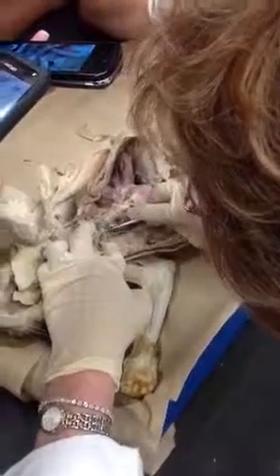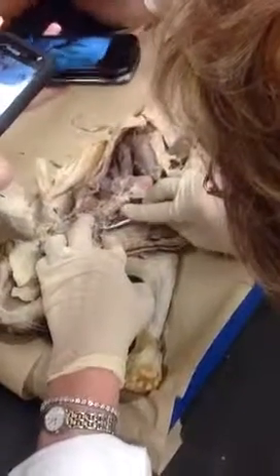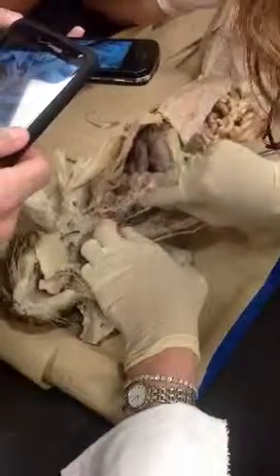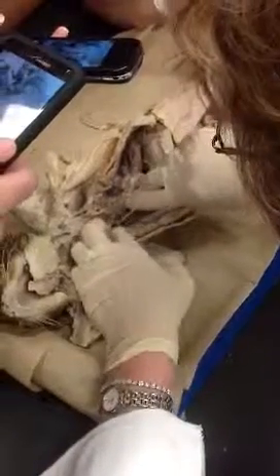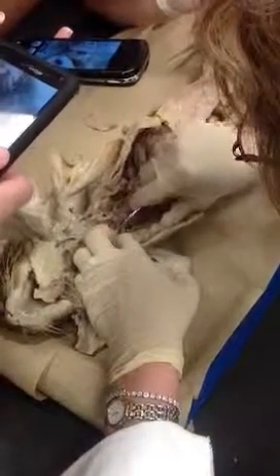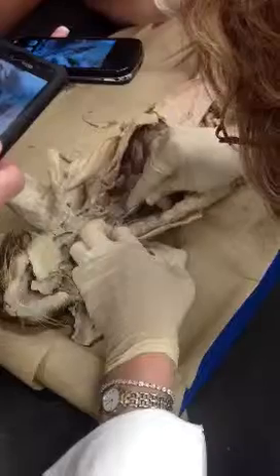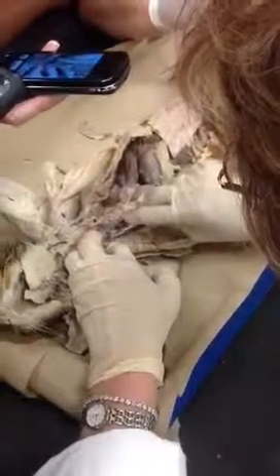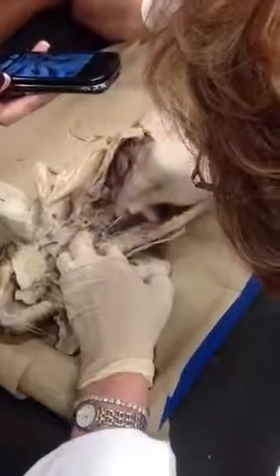Here's your internal mammary. Directly across from that is your vertebral. See it right there? Right next to that, and you have to kind of fish for it because it's a loop. Right underneath that is a loop. There it is. That one is the costocervical. This is the thyrocervical. So let me pull all 3 up.